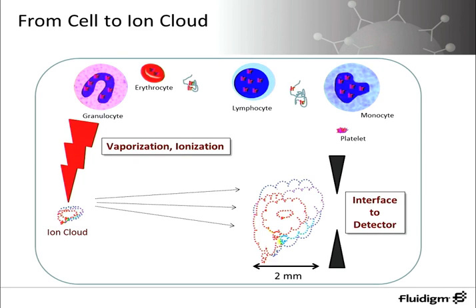One thing I wanted to mention is that there is nothing on the CyTOF that is analogous to forward and side scatter on a flow cytometer in terms of identifying cells by size and granularity. It's a common misconception that when a cell goes through the plasma and is ionized, the resulting ion cloud is somehow proportional to the size of the cell that it originated from.